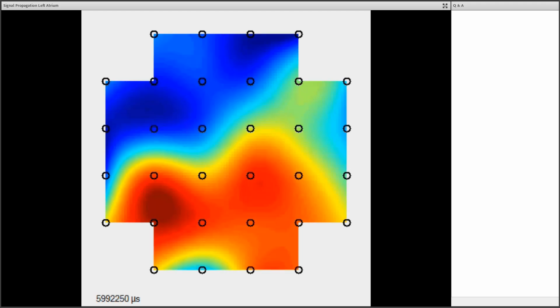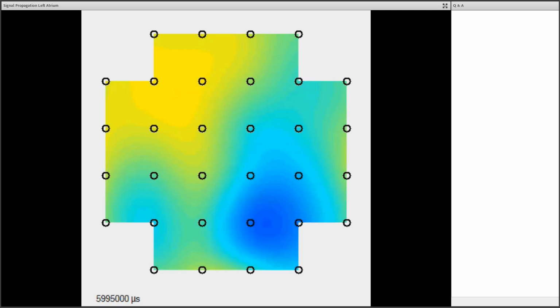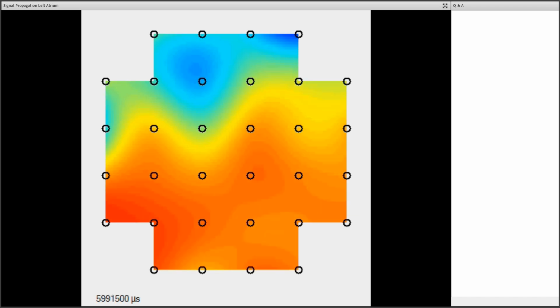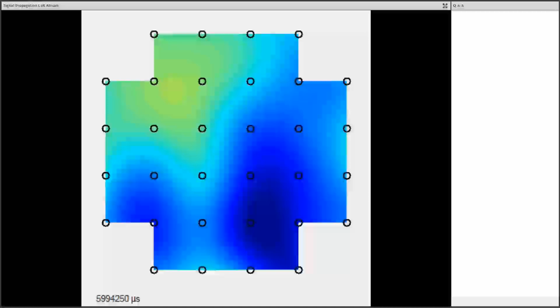Before, you had a false color plot where red means early and blue means late. What you see here is a plot where we translate the time into the time axis as we have a movie, and the red means a positive voltage deflection and the blue means a negative voltage deflection. So basically you see a nice kind of linear propagation in the atrium here.